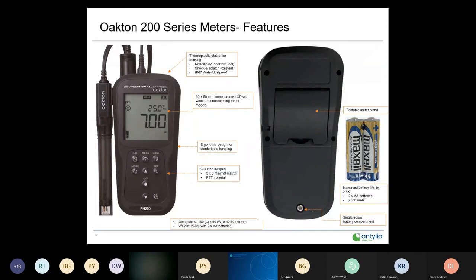The instrument has a nice large, easy-to-read display with backlighting for dim lighting. It has a thermoplastic elastomer coating — a two-process design where the plastic housing is extruded and then coated with a Santoprene derivative — so it's non-slip and rubberized, adding an extra layer of protection. IP67 waterproof, ergonomic design, powered by two AA batteries with over 500 hours of use, and includes a foldable meter stand for tabletop or lab counter use.